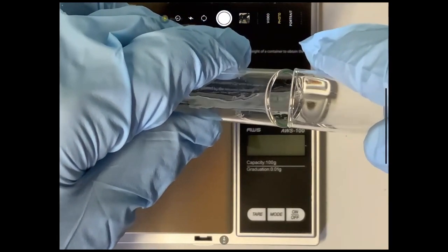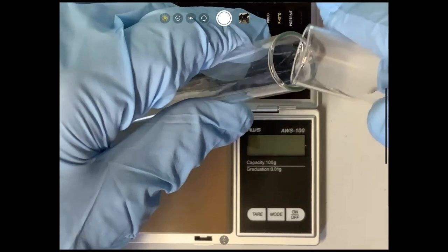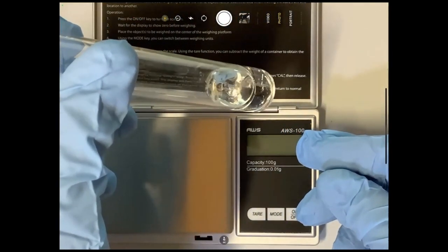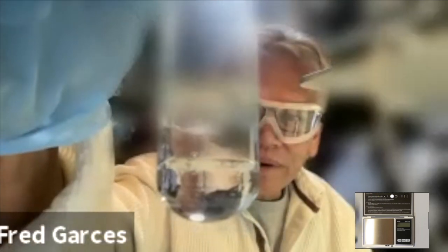And again, you want to pour it down the side so it doesn't upset the surface of the other two. Now this one, you can certainly see that there are layers there, okay? It's easier, I think, if you look at it through here, okay?